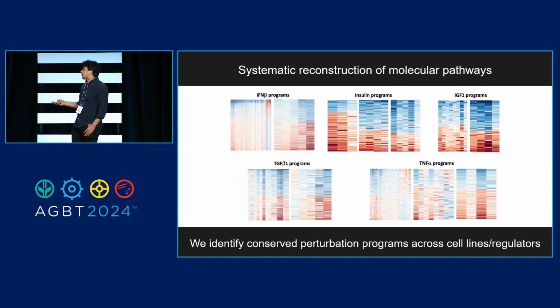And we return dozens of these perturbation programs against all the different stimuli that we look at. And again, all of these data are available online for you guys to score against your experiments.